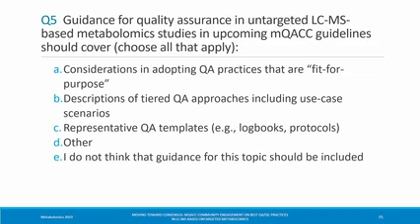So I mean, there are intuitive tiers like train your staff and have SOPs, right? Those are things that it's really hard to do without, and that would formulate a pretty basic tier. Data monitoring is probably, if there were a middle tier, I would say lab temperature monitoring, freezer monitoring, and system performance monitoring. Those are all next up, right? For sure, bottom tier, you train your staff.